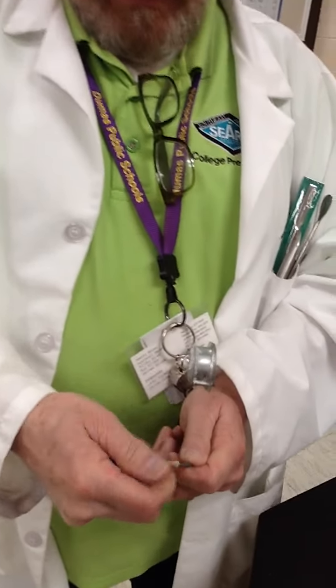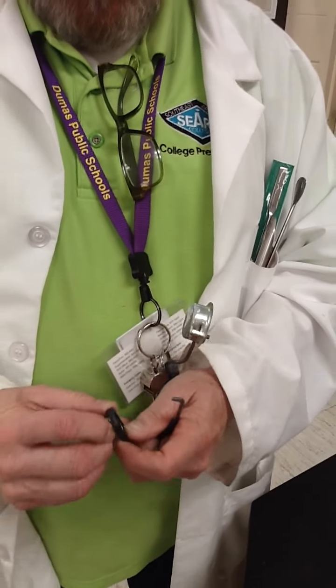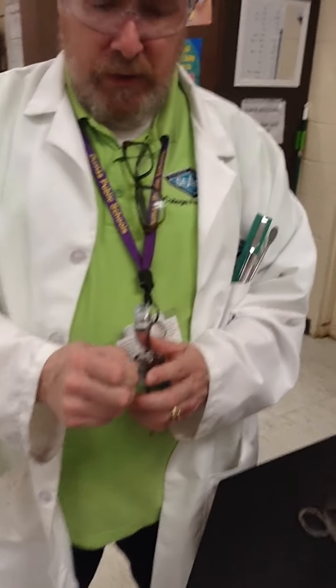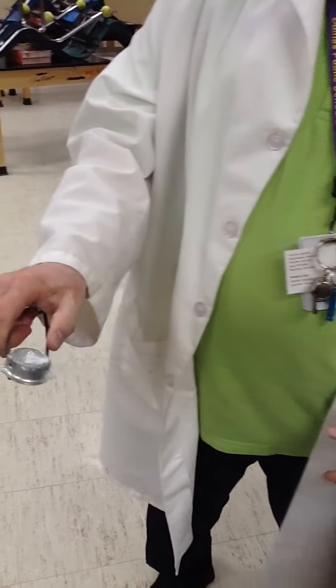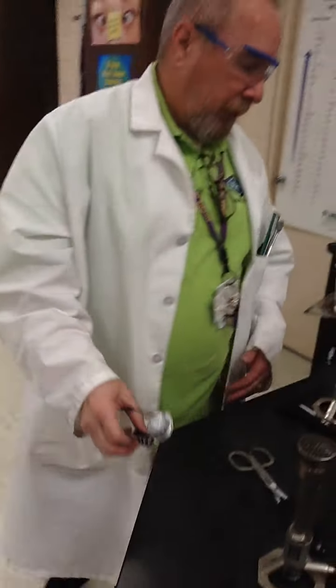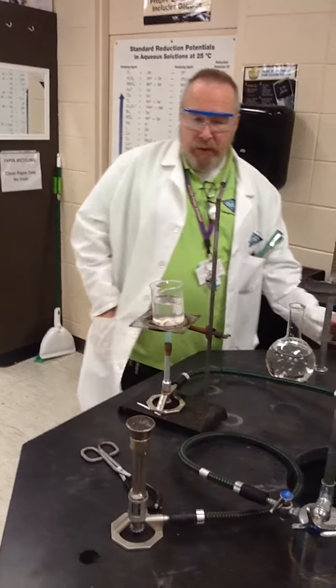And if they wear down to this metal here, it's very simple to screw that off and take a new one. They sell packs of 5 for about $1. Put it in there, and it's usually good for another semester or 2 of student use. I pop it back in under the bell cap, and now it's sparking beautifully and is perfect. I'm going to heat up this water and boil it.